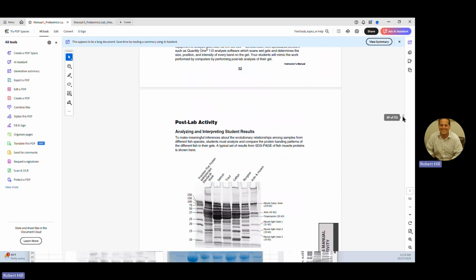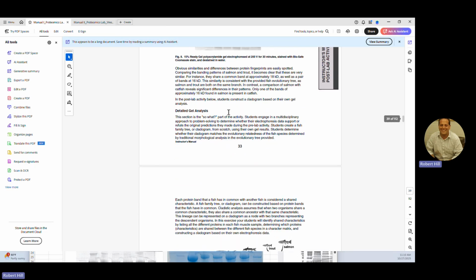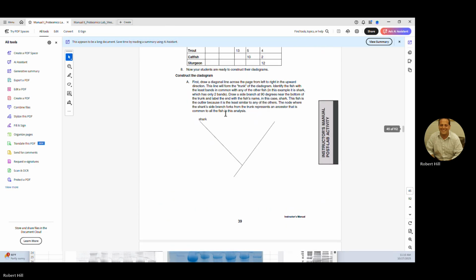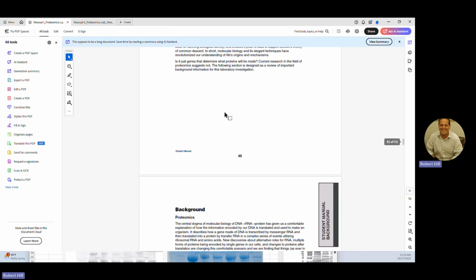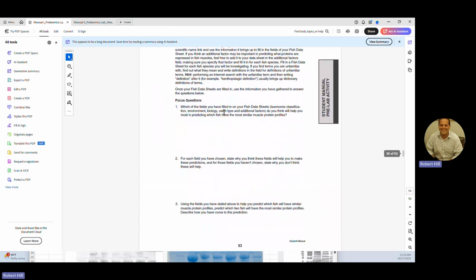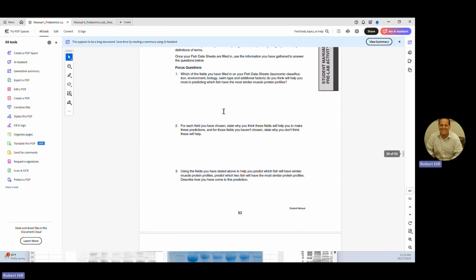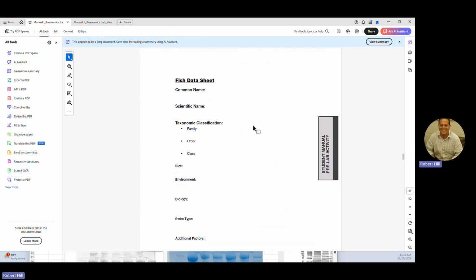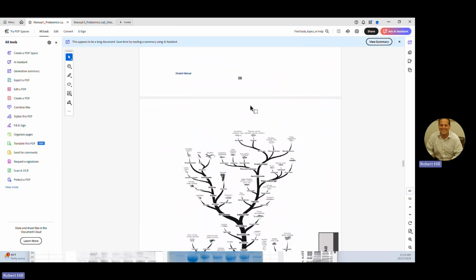There we go, 33. Okay, I want you to read all this stuff and understand it. You will see there are some focus questions that start coming up. I want you to do all the focus questions. The answers are in the back of the manual. It's not about you getting it right or wrong.